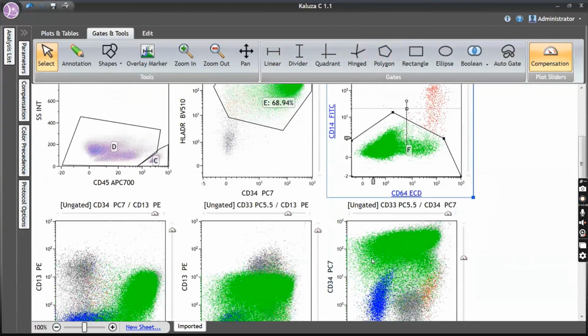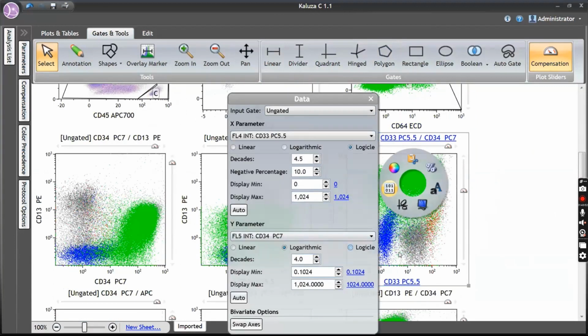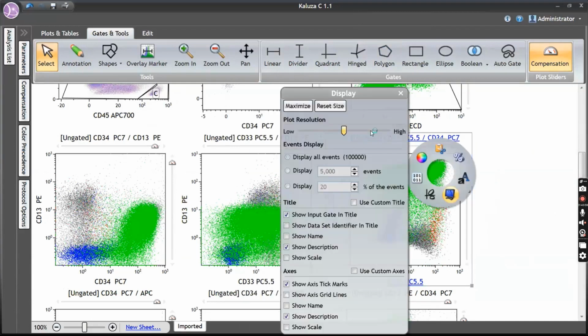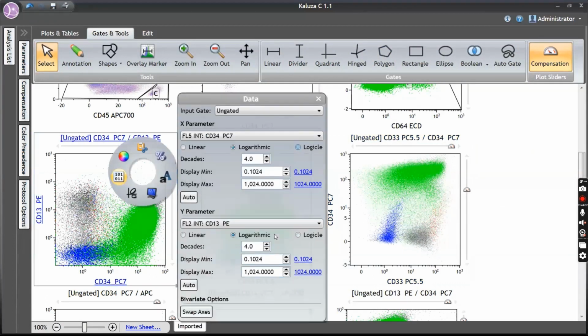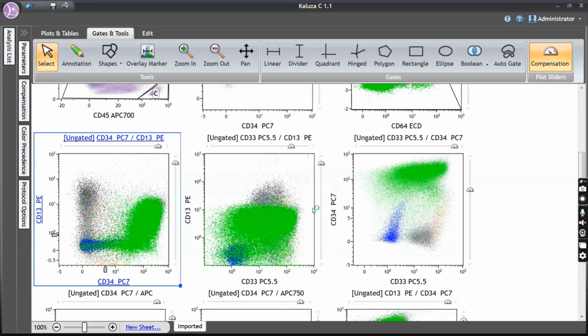Okay. So now this is done. Now you need to see the expression of markers. So we have started with the myeloid tube rather than the B tube. Anyhow, we'll go through, because most of the time you don't know the diagnosis when you're analyzing, right?